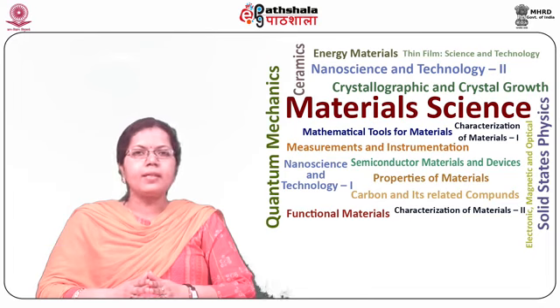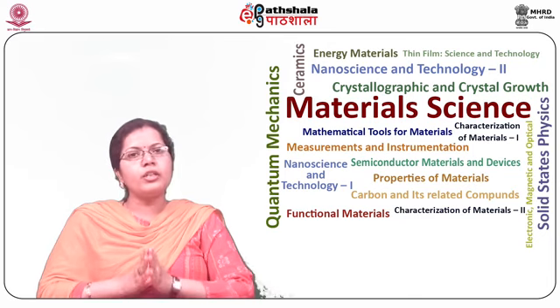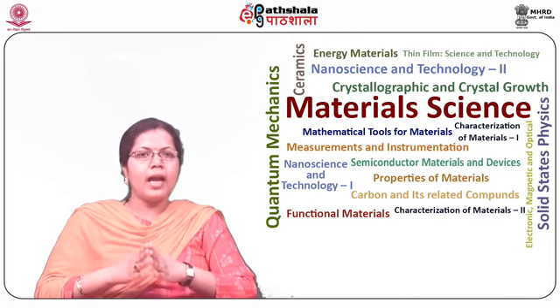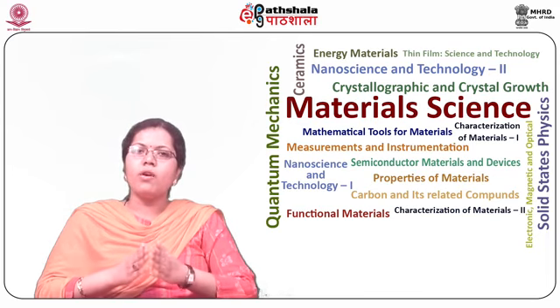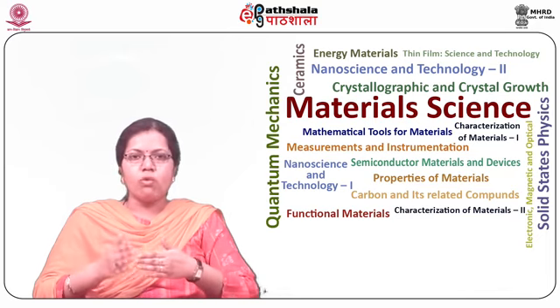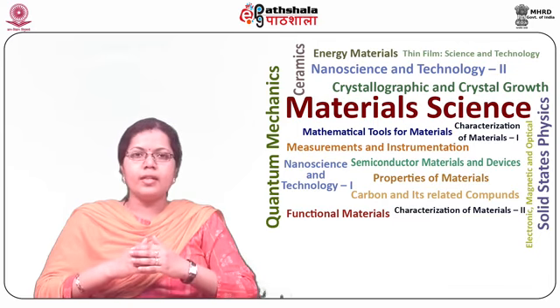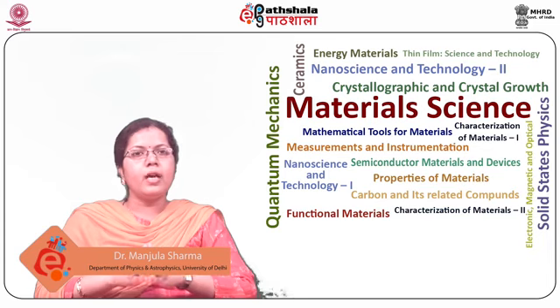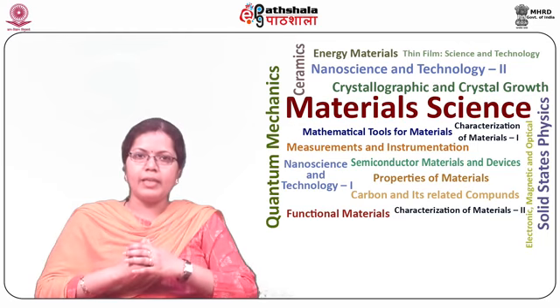So students, let us summarize what we have learned in this module. We discussed the dispersion staining microscopy, in which we discussed the exemplar materials and its applications. Secondly, we studied the phase contrast optical microscopy, in which we covered its working principle, its advantages, disadvantages, and applications. Thirdly, we studied the differential interference contrast microscopy, in which we studied its working principle, its advantages, disadvantages, and the applications.